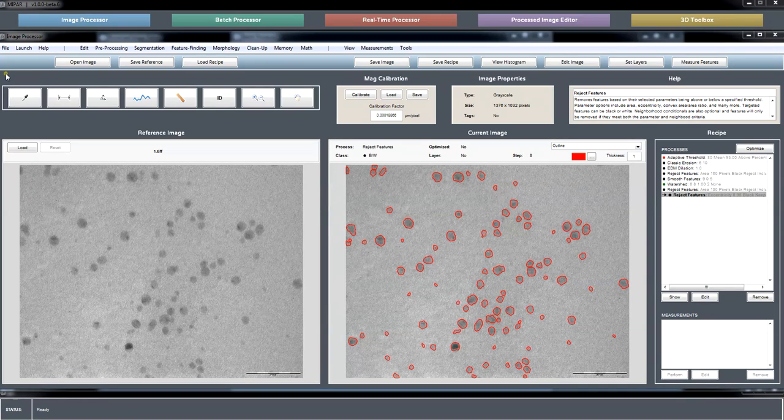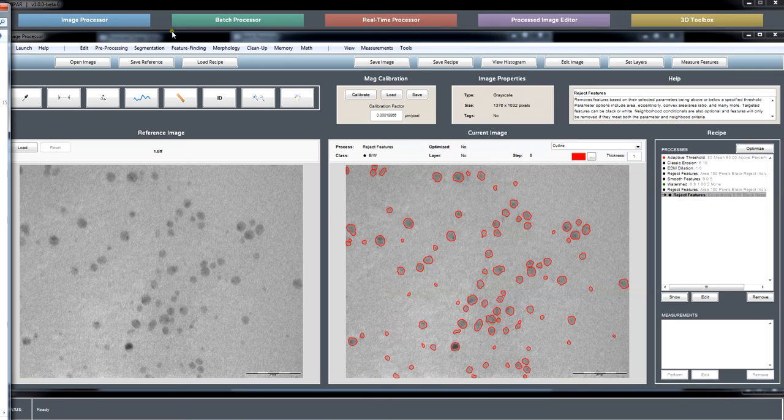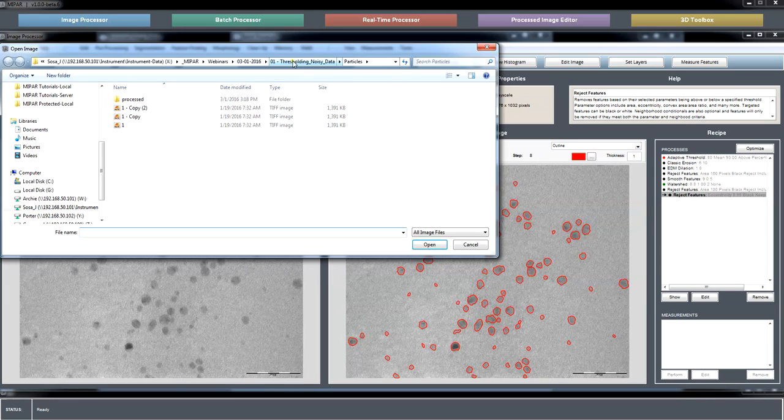Okay, so the grain images we can't use, but I can show you another grain image later on if you're interested in segmenting grains and measuring, and that will tie nicely into the 7th place, which is measuring individual features, which we already somewhat showed, but Romulo wanted an easy way to automate the identification number of every feature. So what I'm doing now is just trying to find, here we go. Meg, I'm guessing this is what you mean by the scale bar on the bottom.